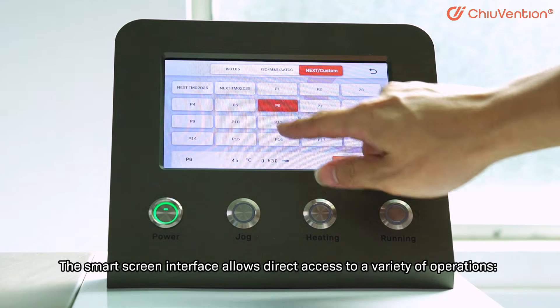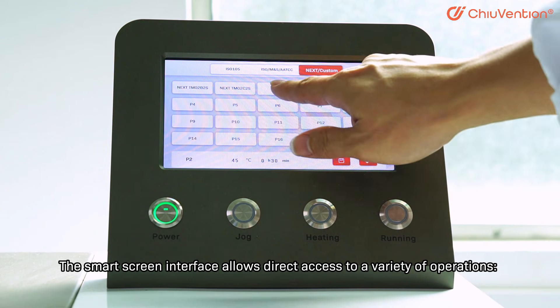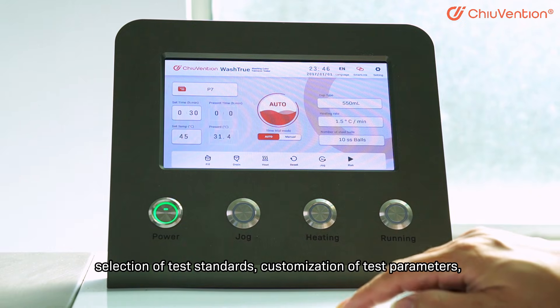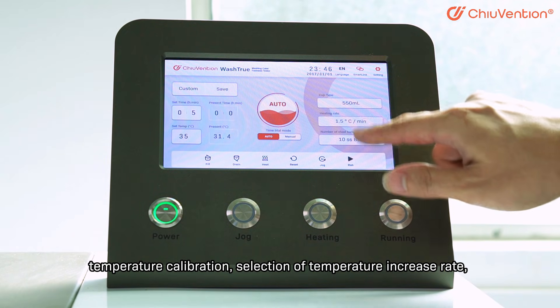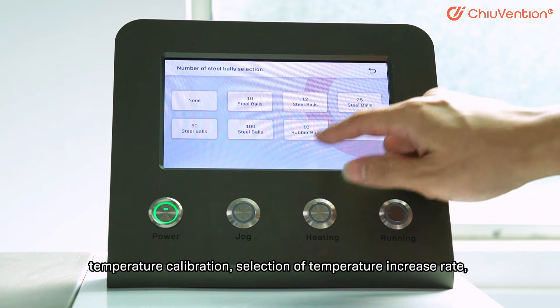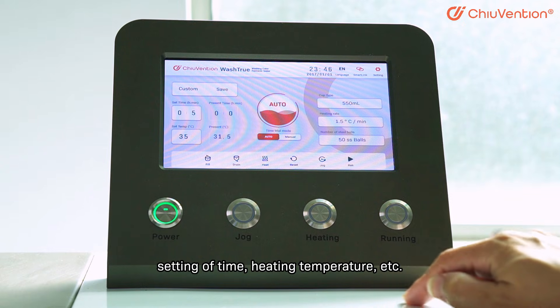The SmartScreen interface allows direct access to a variety of operations, including selection of test standards, customization of test parameters, temperature calibration, selection of temperature increase rate, setting of time, heating temperature, and more.